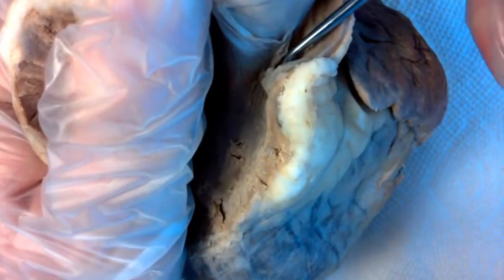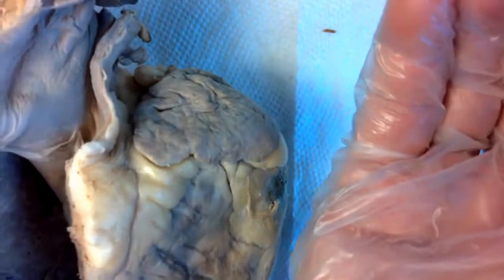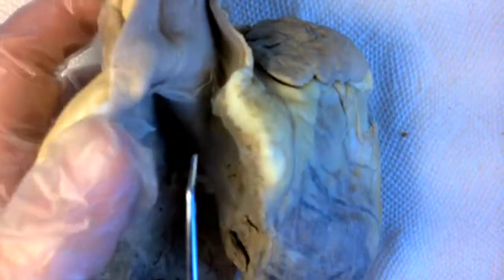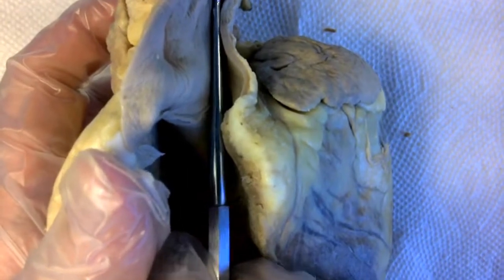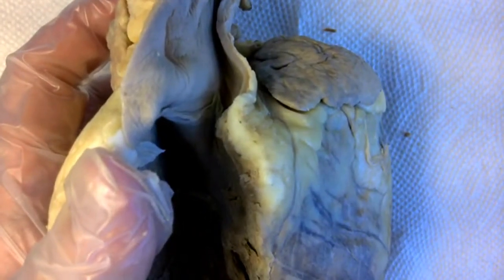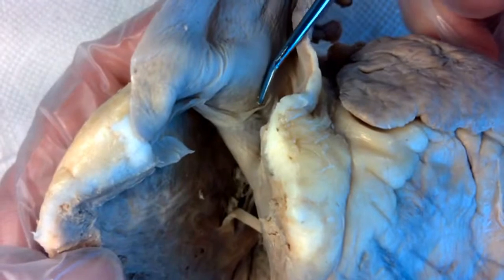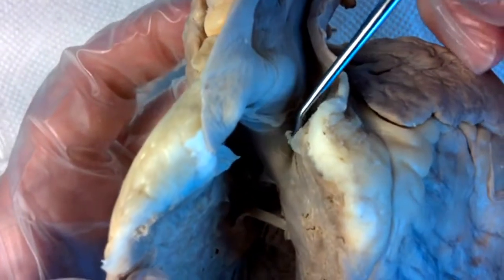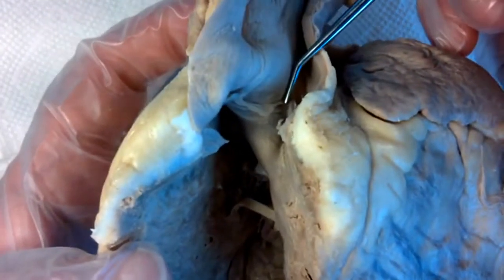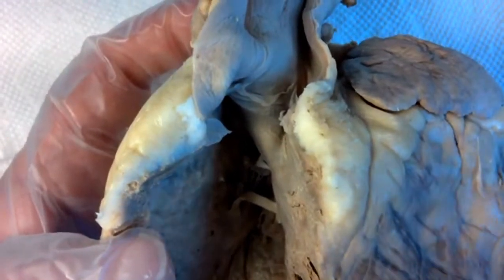Over here on the side. So there's 2 little flaps here. They cup upwards so that blood can get pushed up past them into the pulmonary trunk. But when the pressure decreases because the contraction has stopped in the ventricles, the blood that's in the pulmonary trunk falls backwards against these flaps and closes that valve. So now we don't have blood going backwards into the ventricle. We want one-way flow of blood through the heart, always.